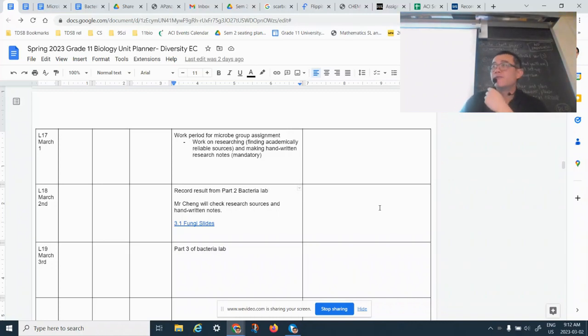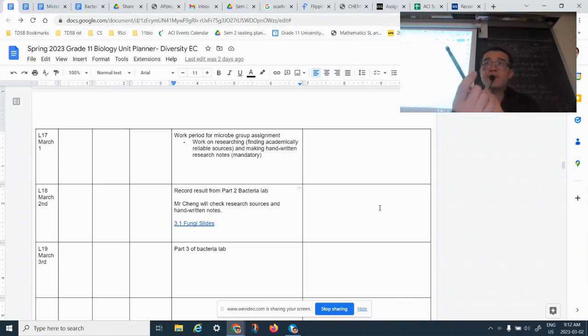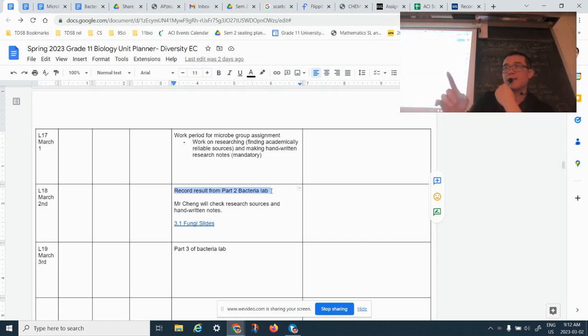Okay, so for today's lesson, there's a number of things that I'm going to ask you guys to do. The reason why I asked you guys to sit in your lab first is the first part: you guys are going to record the result of your part 2 bacteria lab.